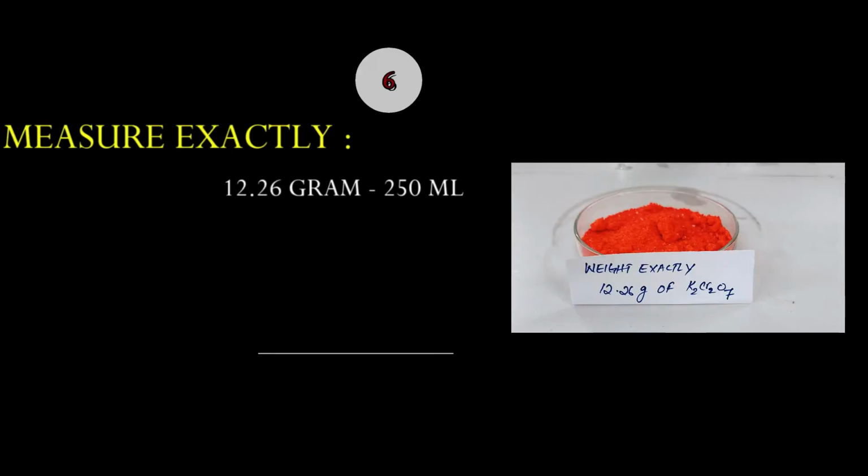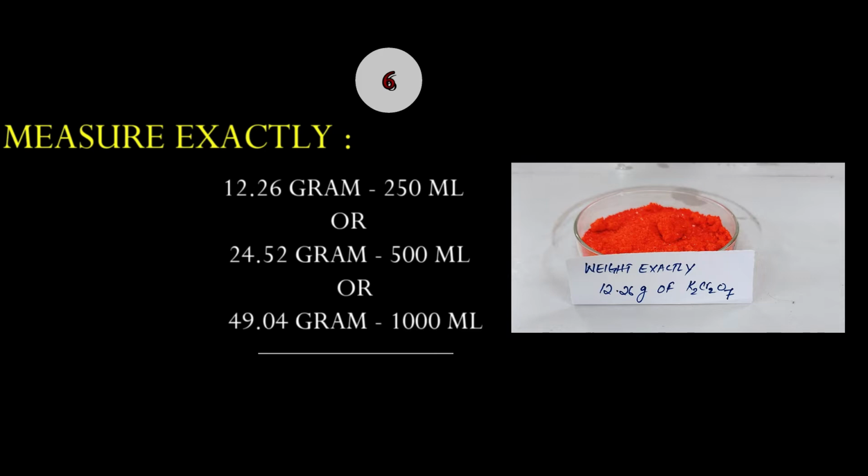In order to avoid unnecessary disposal of unused chemicals and to save chemicals, first of all, check how many samples you have. And accordingly, you prepare the reagent, because if you prepare too much reagent, that'd be just a waste, right?